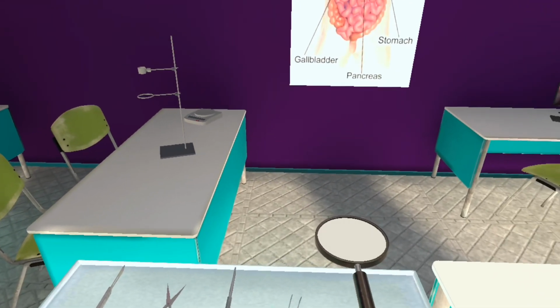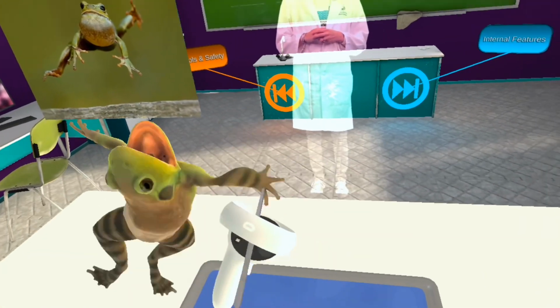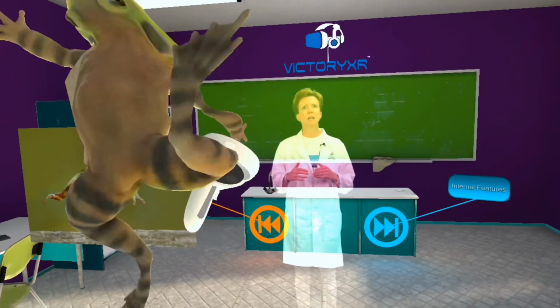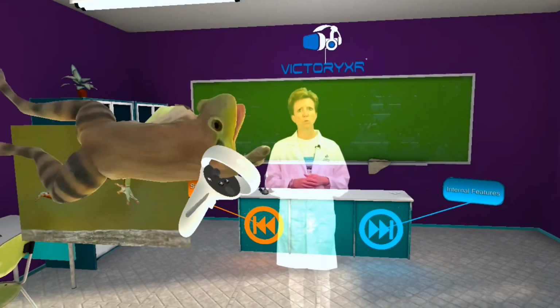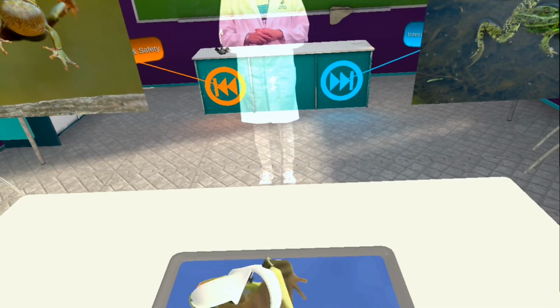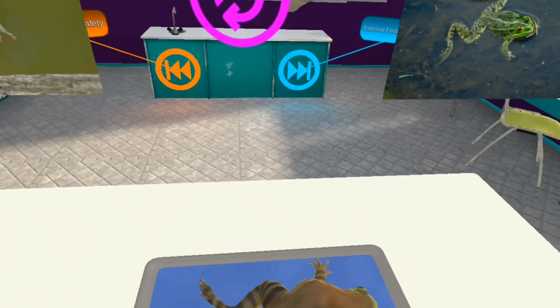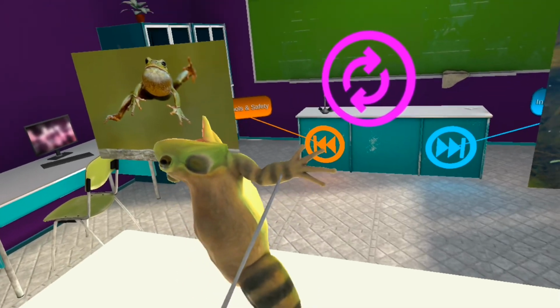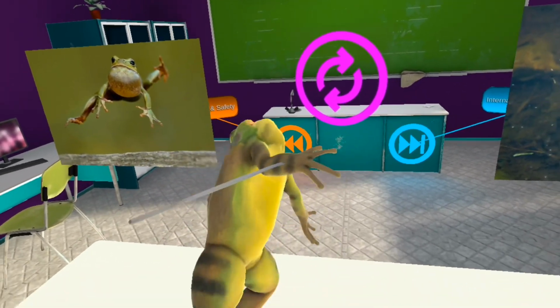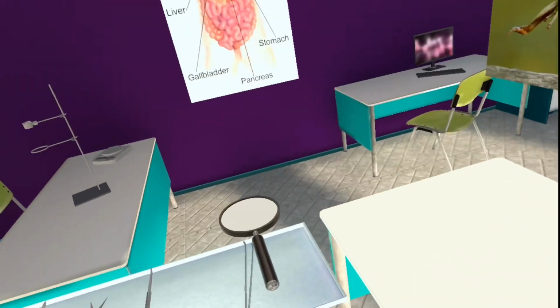What are the forceps? Is that this? Their front feet are not webbed and usually have 4 toes. Now lift the muscular back legs. Is that meant to happen, Wendy? These back legs are also useful in swimming. Wendy, that's frightening me. Frogs have webbed rear feet. I'm going to put him down. Oh, Jesus Christ, I'm not sure that worked quite as it was meant to. Oh, look, that's better. Oh, dance with me. Okay. Put him down.